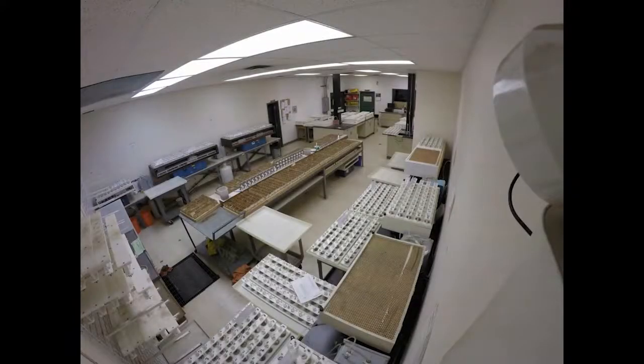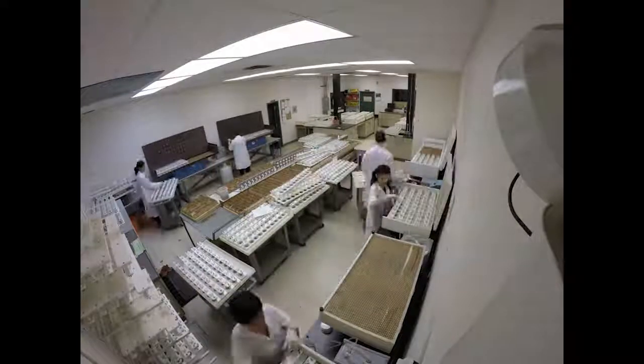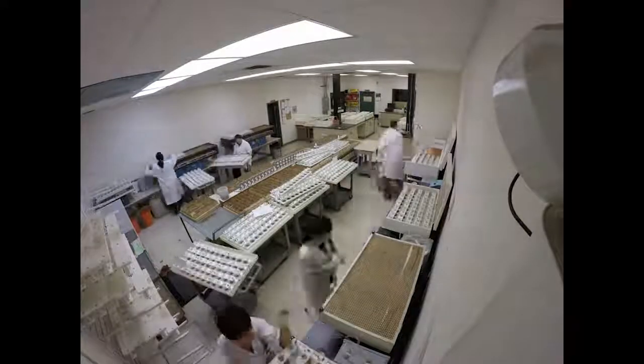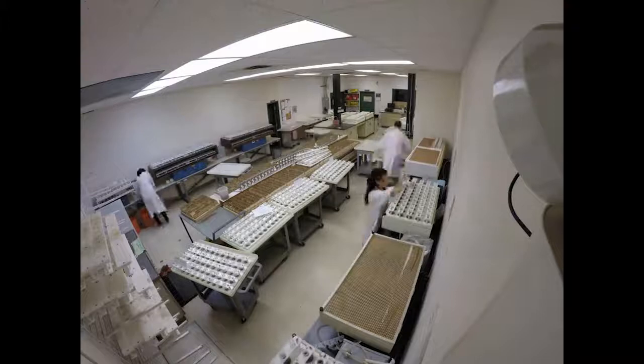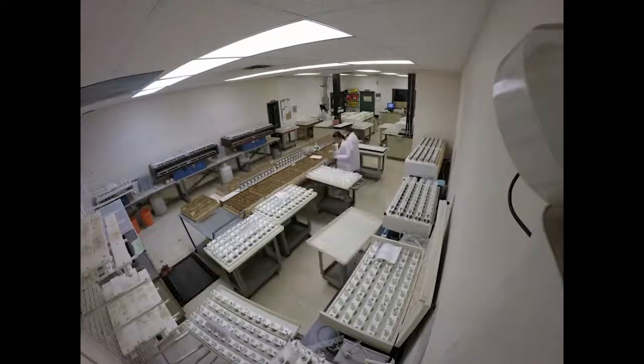On the second morning, technicians begin with sample extraction. Here, the samples prepared the night before are transferred into lab extraction equipment and extraction chemistry is added. The samples are then placed on a reciprocating shaker for 30 minutes to 2 hours, depending on the type of extraction being performed.